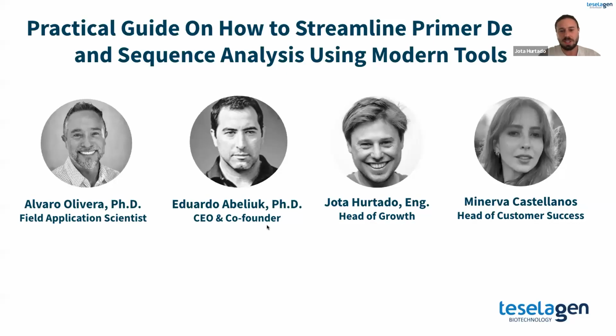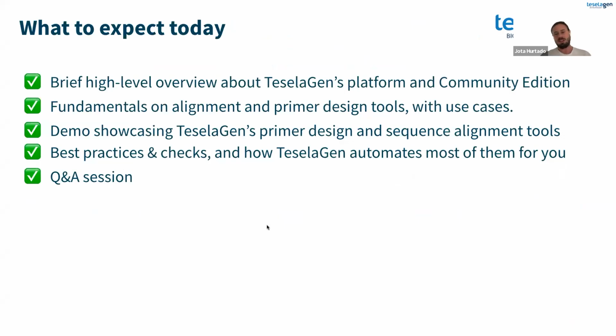So, what to expect during this webinar? Eduardo will start with a brief high-level overview of the Teselagen platform. Then Alvaro will introduce the fundamentals of sequence alignment and PCR primer design in Teselagen. He will then provide a brief live demo of the alignment tools and automated primer designers, illustrating how these tools streamline sequence comparison and verification, PCR setup, and overall experimental planning. And finally, we'll open the floor for Q&A at the end of the webinar.